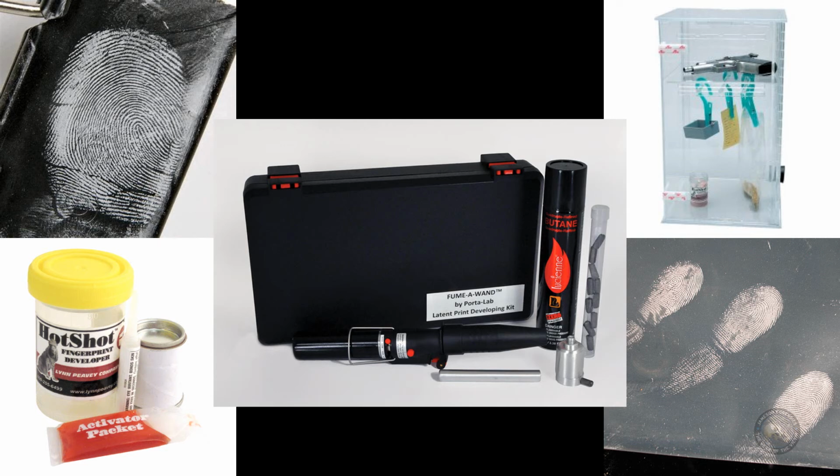Cyanoacrylate ester fumes can also be created when superglue is placed on absorbent cotton treated with sodium hydroxide. As you can see here, you can use a hot shot, which I'll show you in a second. It also comes in a wand formation, which we never had. I wish we had it because it looks awesome and I want to use it. Here's a small example in the upper right-hand corner of just how small the chamber could be. You can use a plastic bag, and I'll show that during the demonstrations. The two other pictures show how it develops into a white substance. Cyanoacrylate also comes in blue for searching, so now you can use blue cyanoacrylate on other colors and surfaces, which helps with the photography.